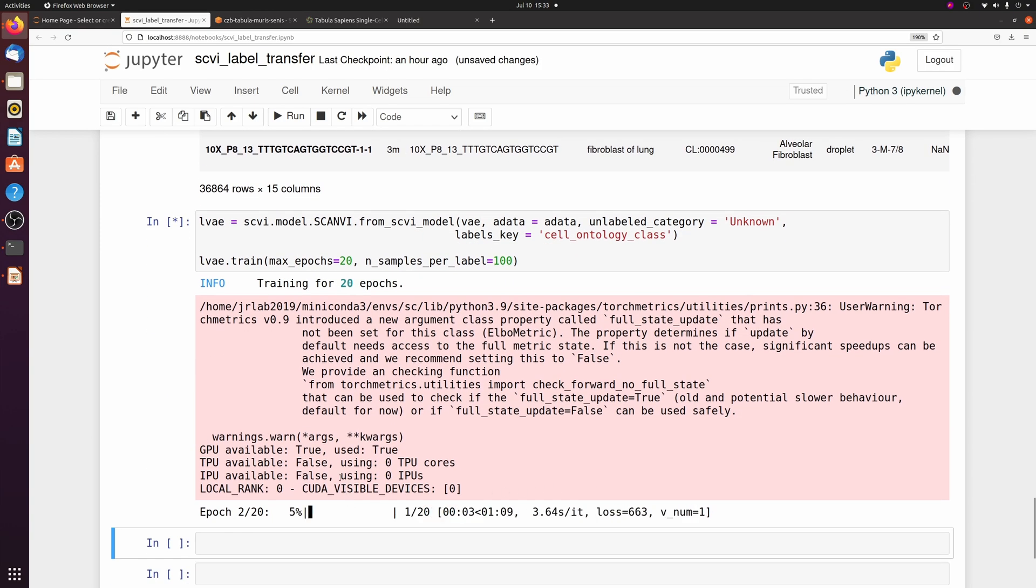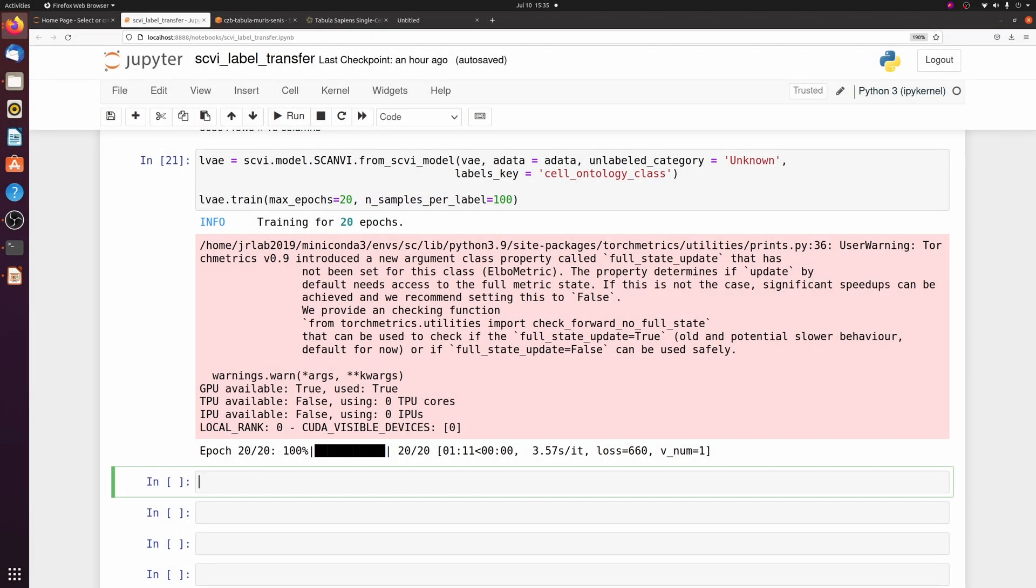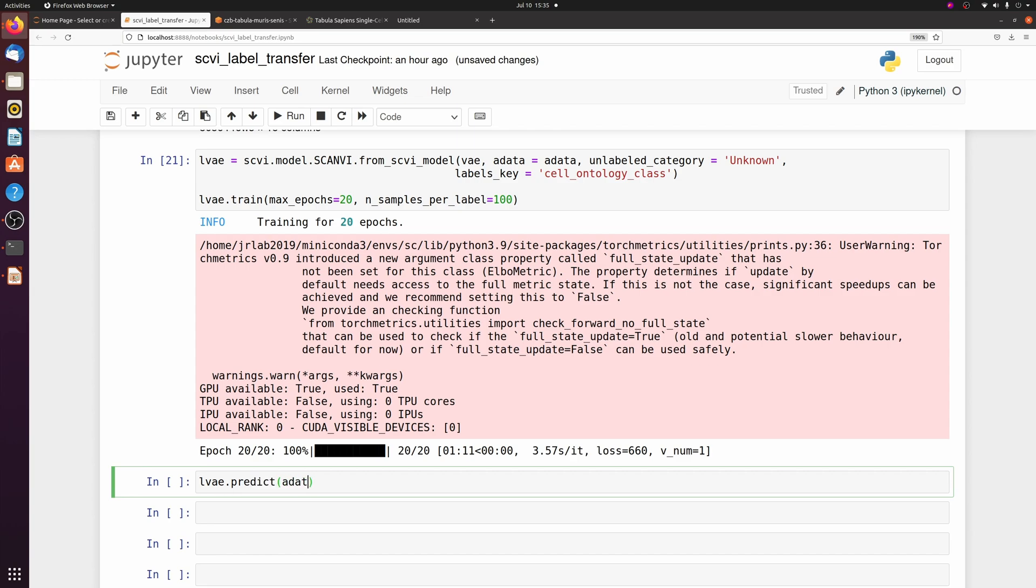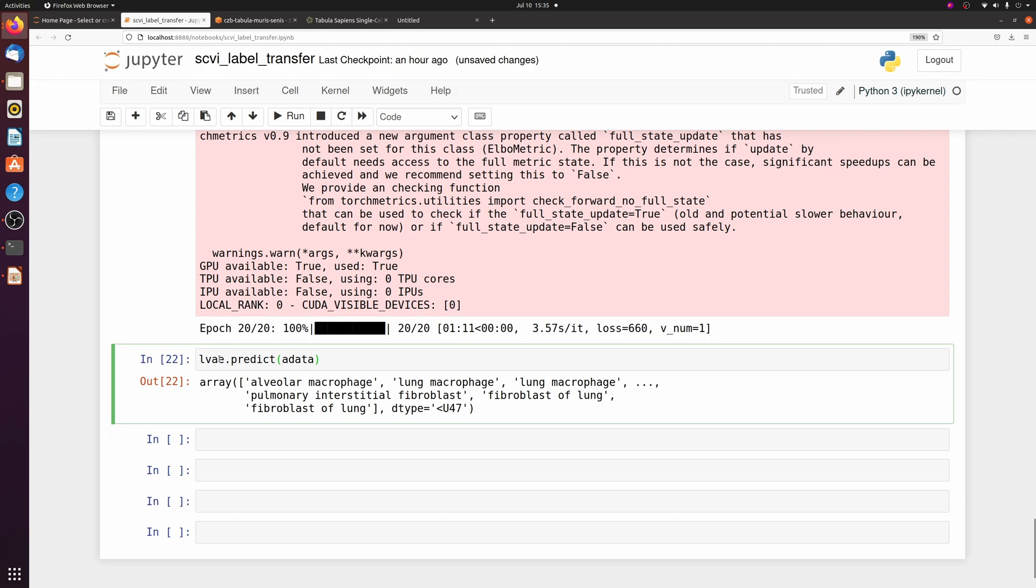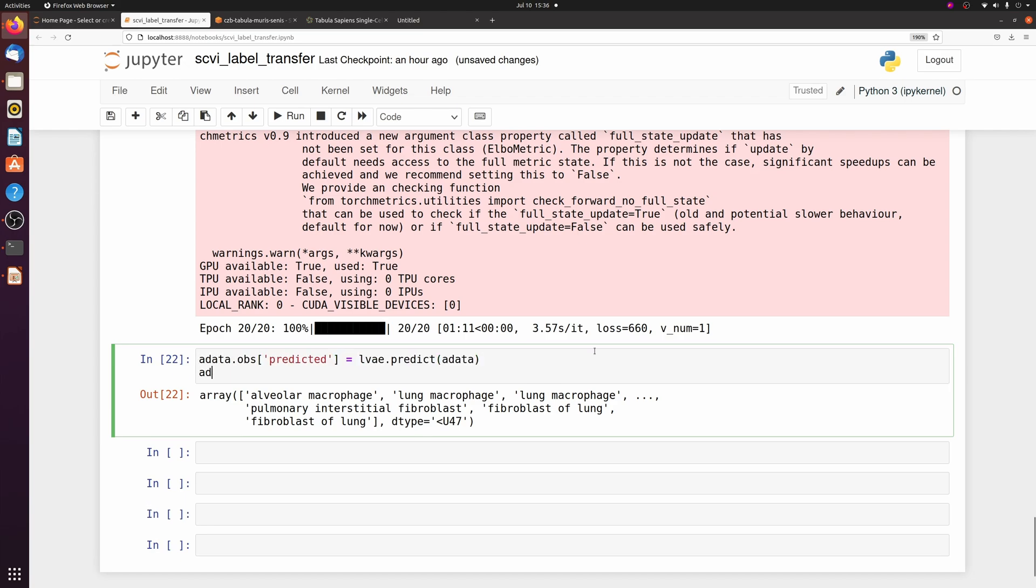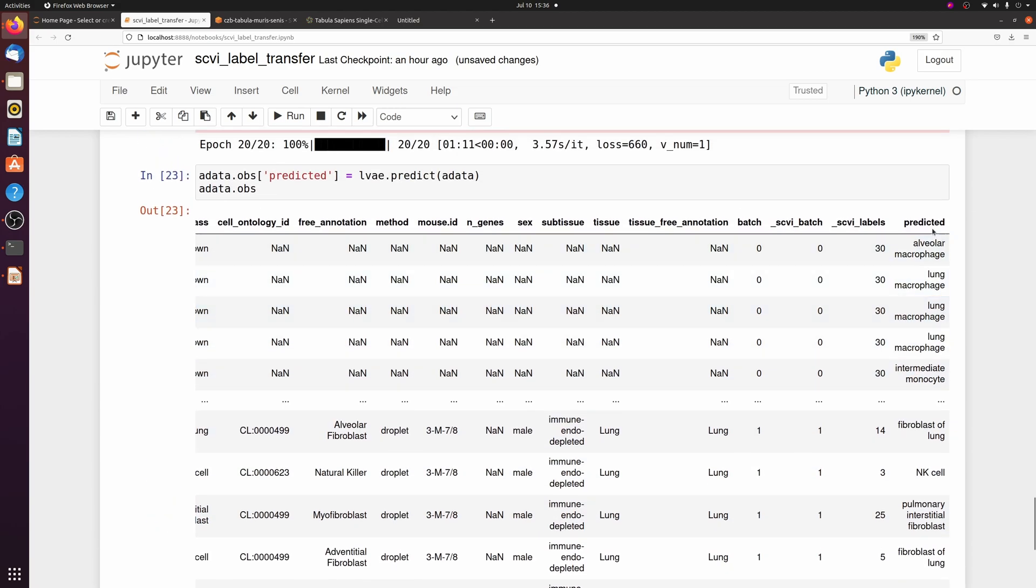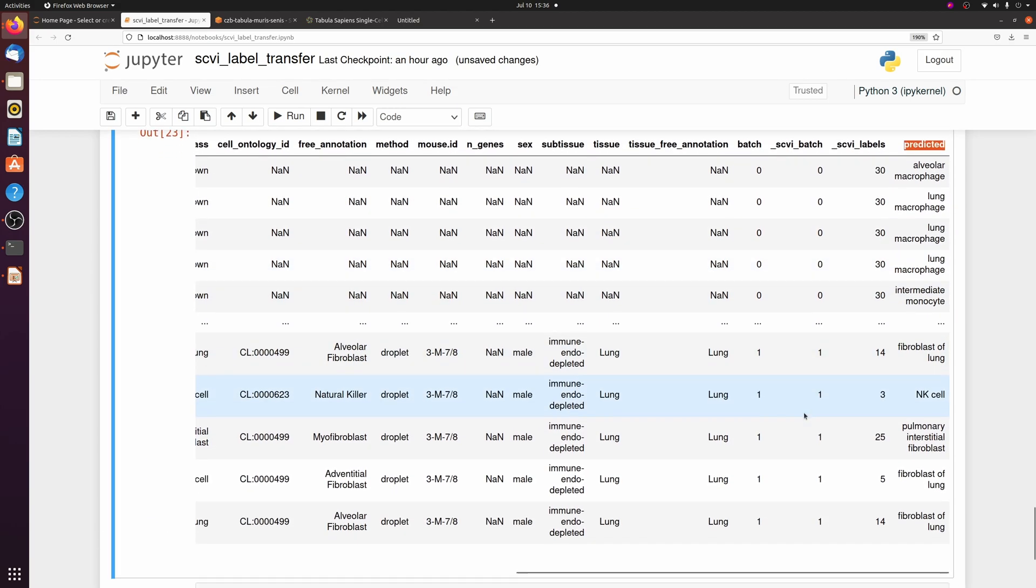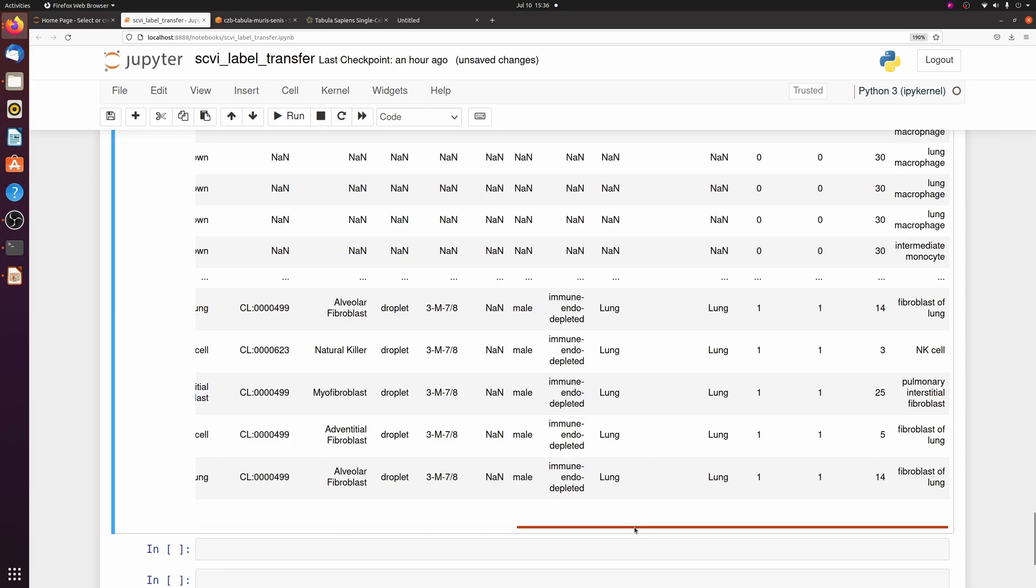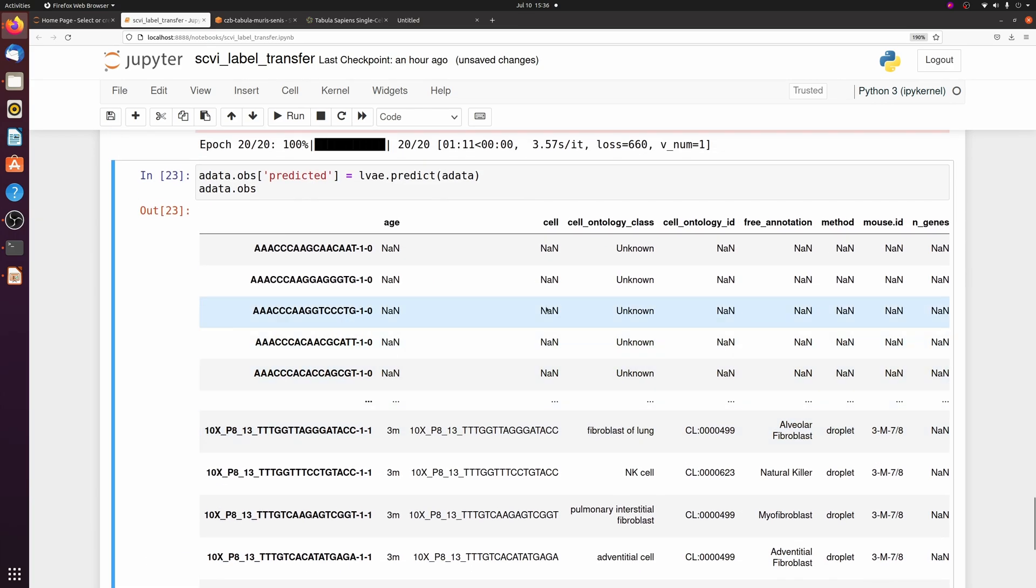We're just going to set the max epochs to 20 and the n samples per label to 100. This will be a little faster, so it should only take about a minute. Once that finishes training, we can get the predicted labels. So it just passes an array of cell types. We can assign a new observation column based on these cell types. I'm just going to call it predicted.